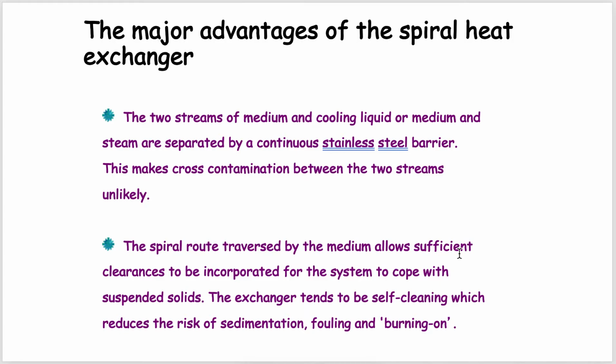Rather, they are continuously moving and get easily cleared. That means they get very little chance to settle down in the sterilizer and cause problems.